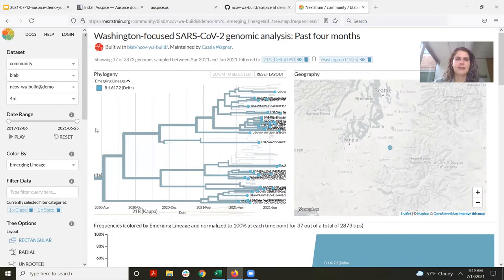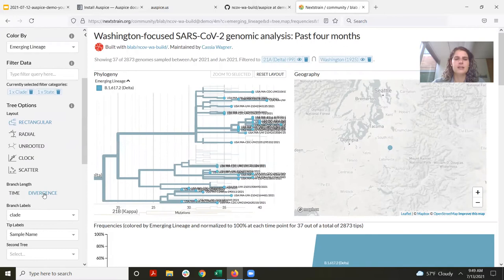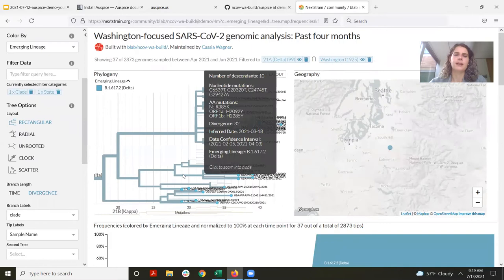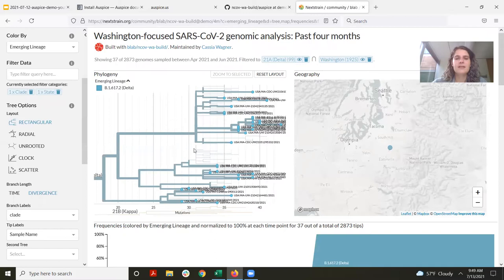When exploring an outbreak or a specific variant in the state, I'll often switch the tree to a divergence tree. Currently it's a time tree with time on the x-axis, but if I hit divergence, this shifts to showing mutations on the x-axis, which is a more appropriate way of looking at a smaller portion of the tree. Because we have the Washington filter on, the sequences shown in thicker lines are all from Washington state, while these thin lines are sequences collected from other places. You can immediately see there have been a number of introductions of delta into Washington state — many haven't taken off, but some really have caused continued transmission here.